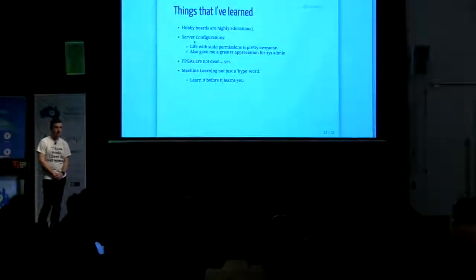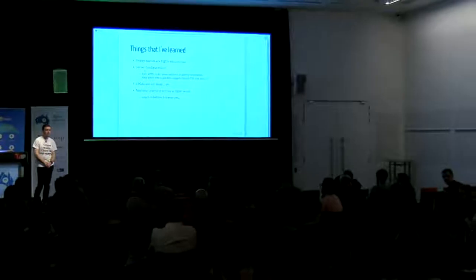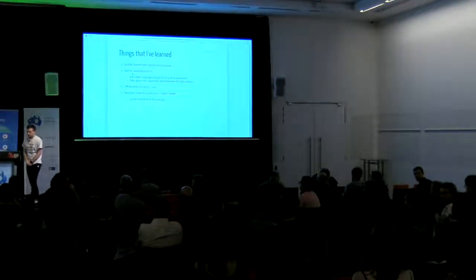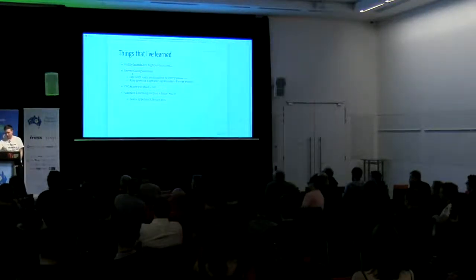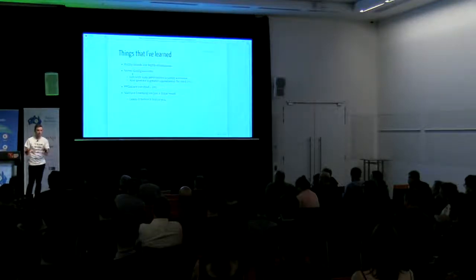Thank you. I was just wondering if you'd tried running this on the Intel Phi co-processor, given it gives you something similar to this, a bunch of x86 processors. Yeah, that's probably something I didn't mention. The reason that we need something out there is because you can run these particular RNNs on a laptop, but even the powerful i7 core laptops will still take a week to run a 48-hour MinION run, which is quite slow.